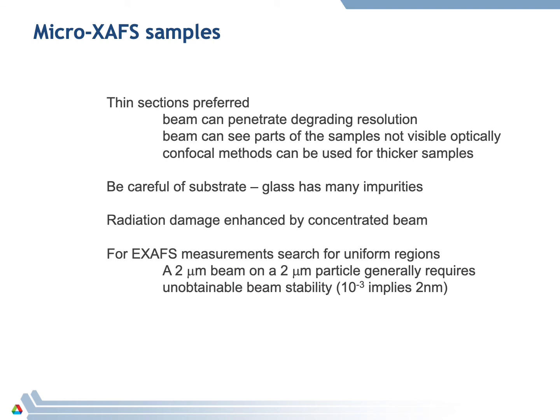I'll just mention a little bit about micro XAFS. That's becoming more and more of interest, with people measuring in the microprobe. In that case, we usually end up wanting to have thin sections, because if the beam penetrates into the sample, it can degrade the apparent resolution. So if you have a 1 micron beam, but it's penetrating 10 microns into the sample, then you're not necessarily measuring a 1 micron image of the sample.